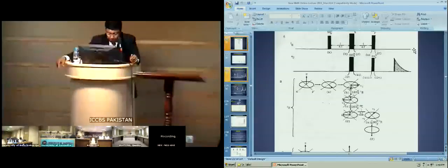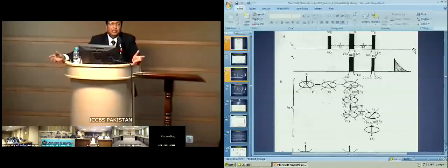Sir, any particular instrument be used for this magic of pulses? Every NMR is equipped with INEPT pulse sequence. Now there are much better pulse sequences available called DEPT, distortionless enhancement by polarization transfer. Theory is same. You don't have a distorted inverted peak. It's called DEPT, distortionless enhancement by polarization transfer.